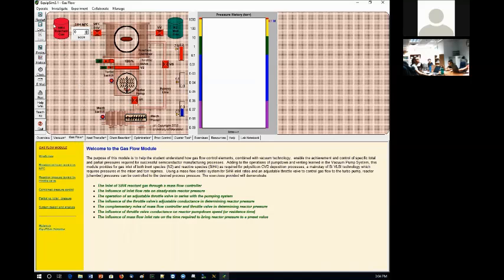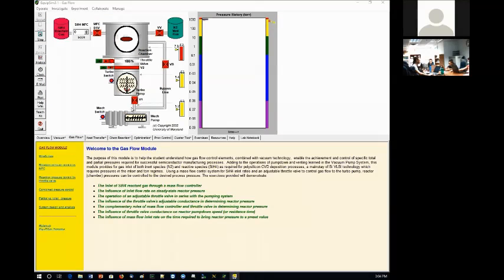Now all of a sudden I'm seeing the new thing here that says silane reactant gas. So that's how we're going to introduce the gas into our reacting chamber. I will start the simulation again. I'm going to turn on the mechanical pump. And maybe now we can work on the mass flow controller, MFC, as shown here, and also this throttle valve.